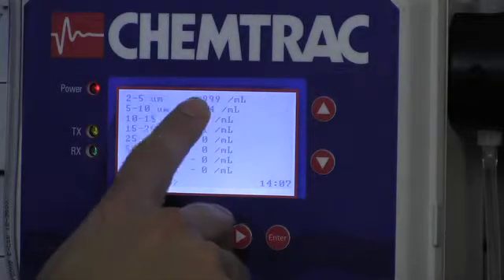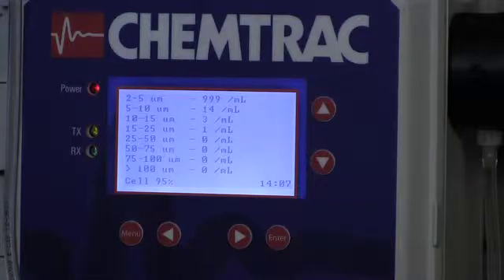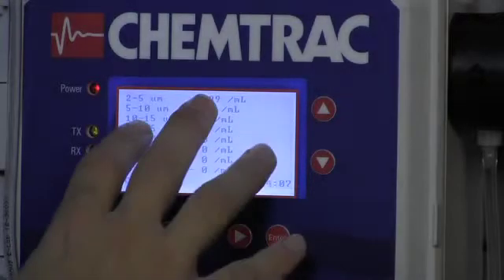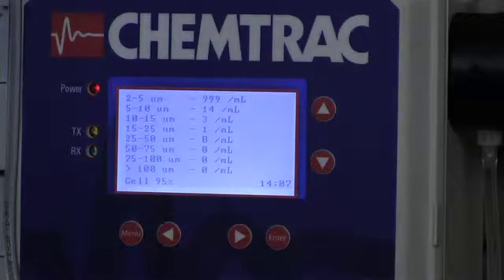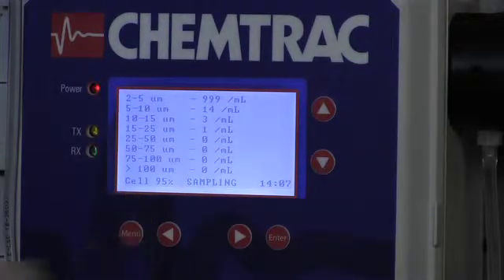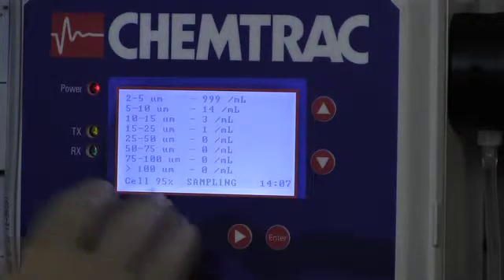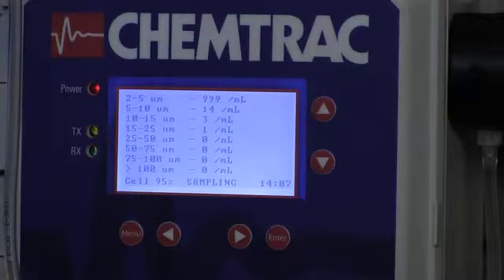So now you can see we have exactly 999 counts. Now that does include our background counts, so that would actually be about 950. We have really no way of telling the unit what the background counts are, so that's why it's important that your background counts are low, less than 50, ideally.